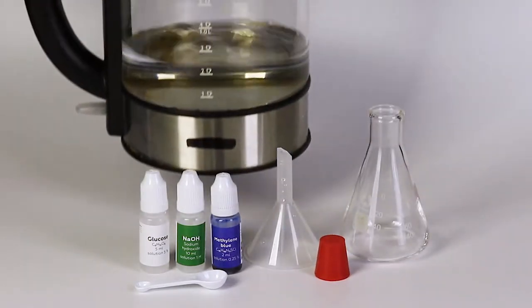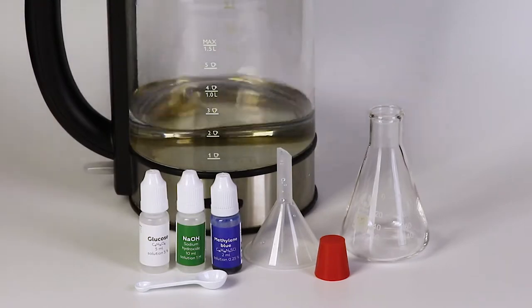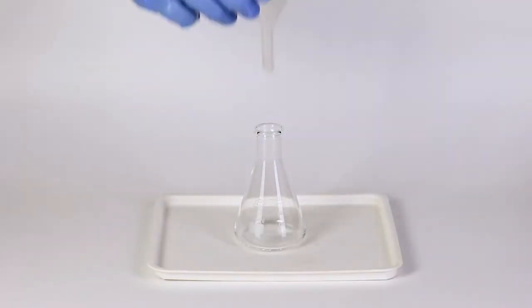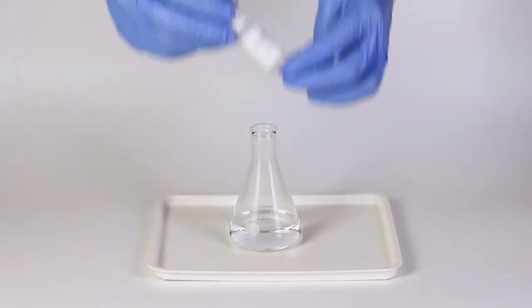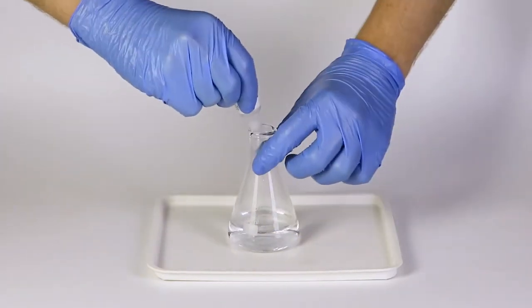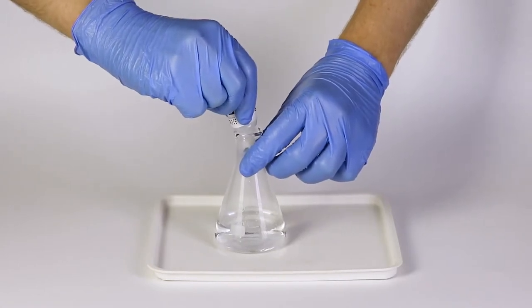Prepare boiling water in advance. Put the funnel into the flask and add 40 milliliters of hot water. Remove the funnel and pour the entire bottle of glucose solution into the flask.